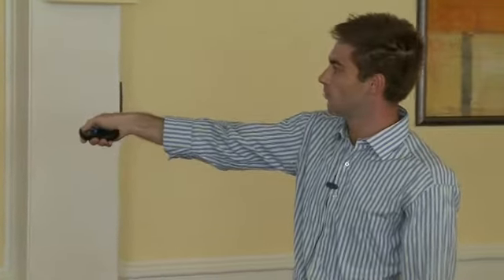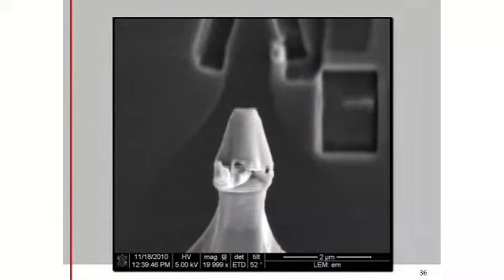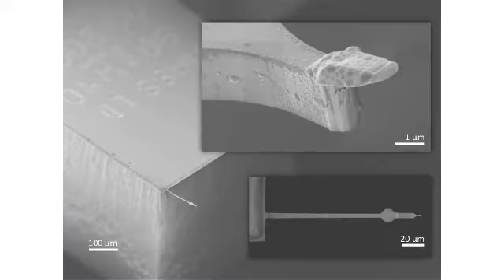He welds that probe to the piece with a platinum welding technique, which involves putting platinum gas into the focused ion beam chamber. And then he pulls this thing out of the wafer. And now we've got this little lamella with a little quantum well right beneath the surface here. He takes this, he brings it near a cantilever, which is also in the system, and attaches that piece to the end of the cantilever, welds it on with some platinum, and then you've got this little quantum well, which presumably is here, sticking out on the end of our tip.